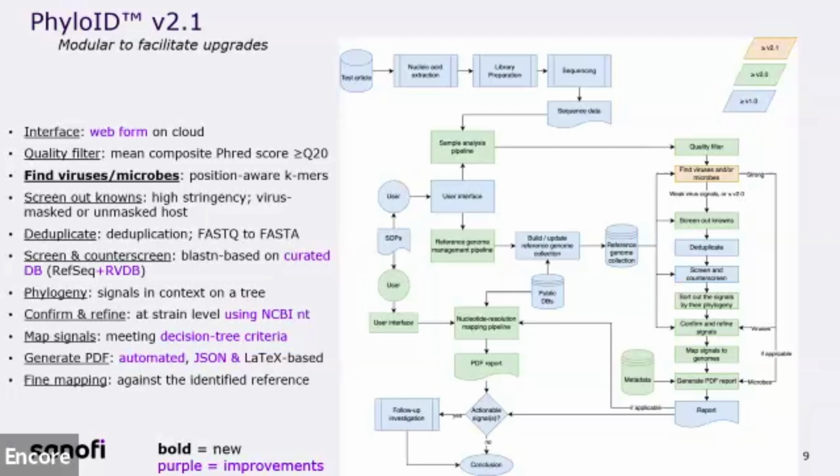So with that approach, you can essentially take the magnet and pull all the needles out of the haystack. You're going to get some hay as well to come along with it. Whereas the previous approach, version 2.0, the host prefiltering, is we get rid of the hay, and then there's still some hay and needles left over.